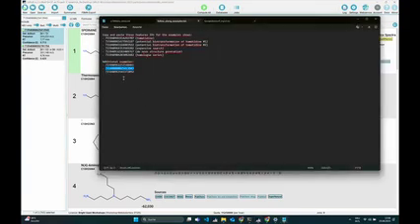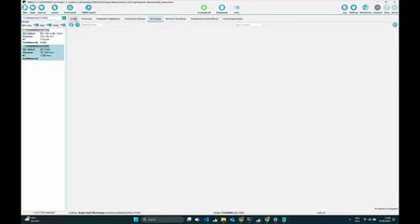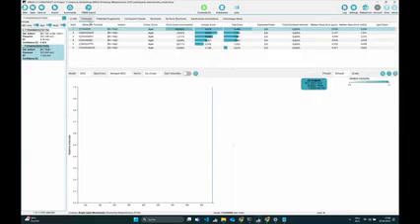Okay, I think I have one more example, but this is actually quite boring. This is just one example where we don't have any computations, where you should be a little bit careful. If we now go to the formulas tab and to the MS2, we can see we really only have one peak. Of course, if you encounter features like these, and if they haven't been filtered out by filtering out bad hits with these toggles here at the top, you will probably not expect a good structure hit, and in fact we haven't even computed structures. So just be careful with whatever you look at. It might be that the features are just bad. You don't have any information in your spectra, so you can also not expect good hits.